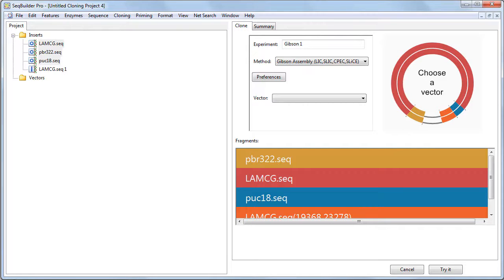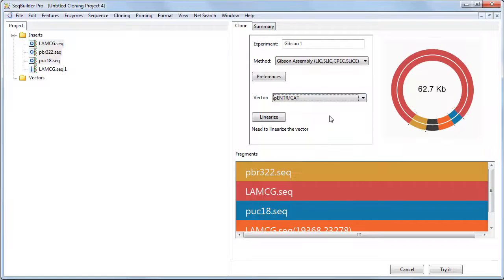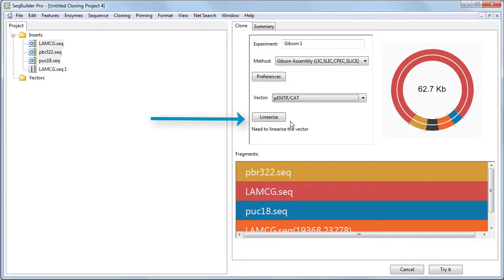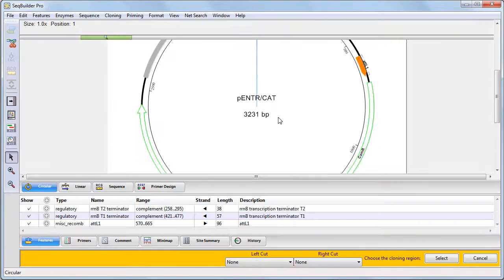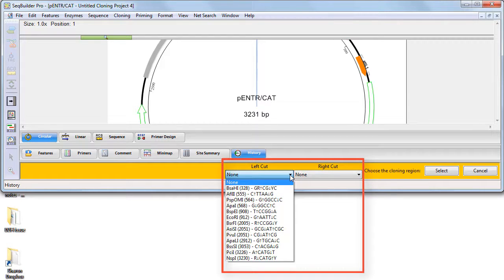Next, choose a vector from the Cloning Vector Catalog using the Vector drop-down menu. If the Linearize button appears, press it and choose cut sites from the window. The menus automatically include only those enzymes that are unique in the vector and which will not cut the inserts.